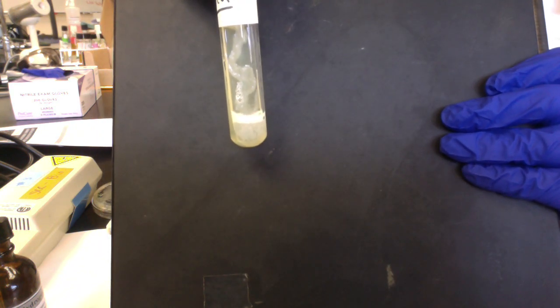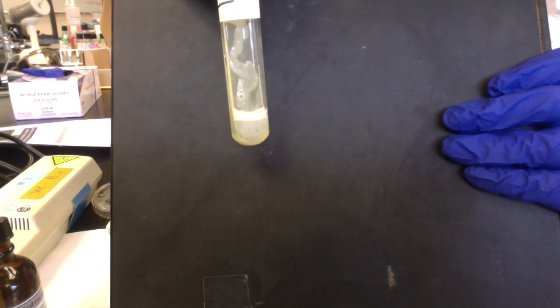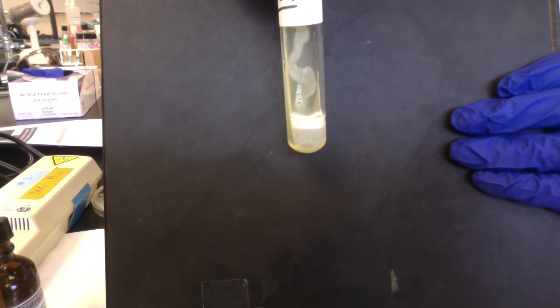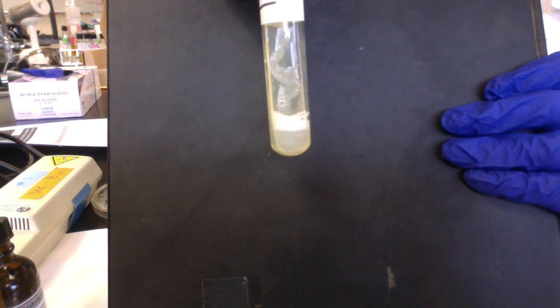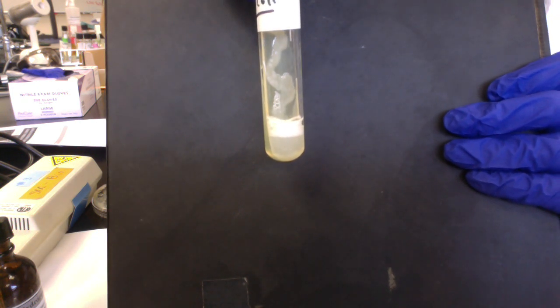And again, that's because the E. coli makes the enzyme catalase that breaks down hydrogen peroxide into water. Ooh, and I can actually hear it sizzling. Can you hear it? Sizzling? Popping. It's breaking the hydrogen peroxide down into water and molecular oxygen. And molecular oxygen is a gas. So the bubbles are the oxygen being formed. So again, folks, I'm not sure if you can see this well, but this is a much stronger catalase test.